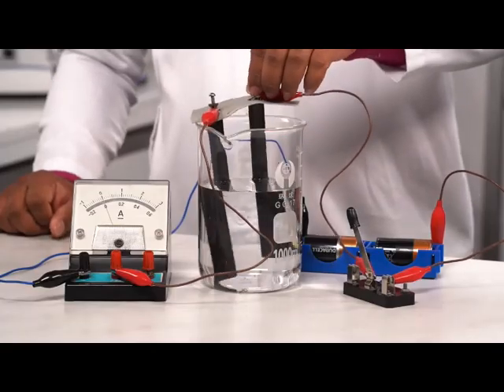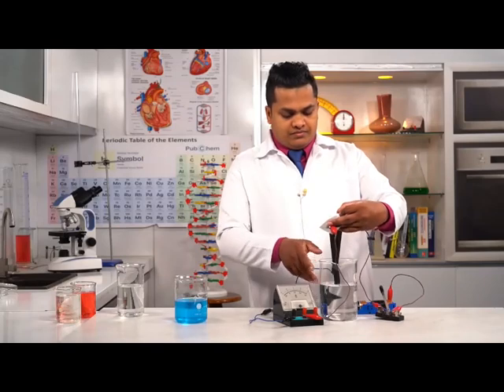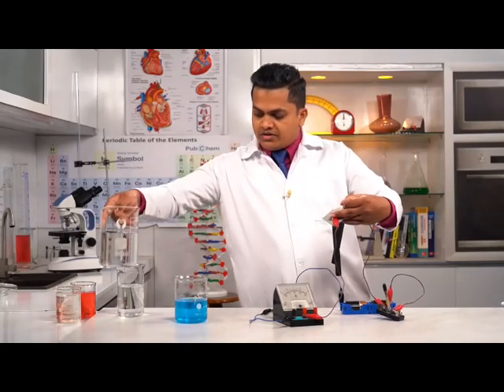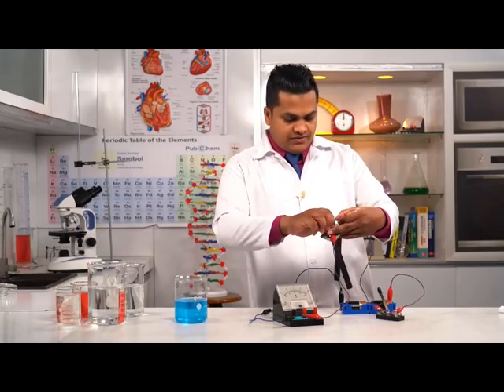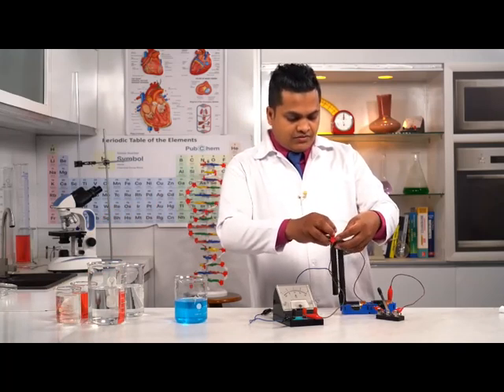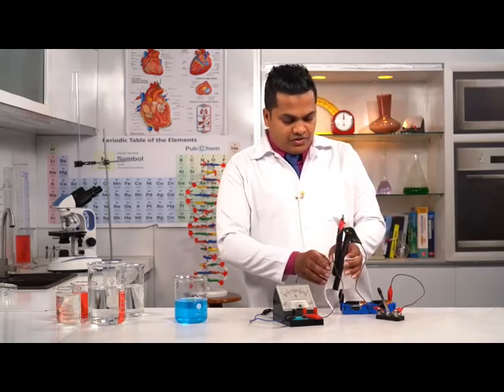So let's remove the system and we'll go for the final solution. So the final solution is copper sulfate solution. So as usual, we have to wipe out the rods.